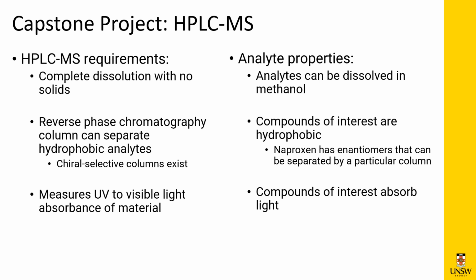The HPLC-MS is also distinctly appropriate for the determination of naproxen enantiomers, as chiral columns can be used to separate R-naproxen from S-naproxen. A comparison of the returned pills to the authentic and seized ingredients is also appropriate for HPLC, as to determine the similarities. On the basis that the returned aspirin is the same as the authentic, the HPLC data should look highly similar in regards to ions and concentrations found, where otherwise there is a chance that it would share HPLC characteristics similar to the clandestine ingredients or otherwise.